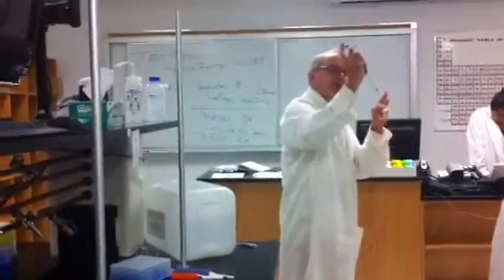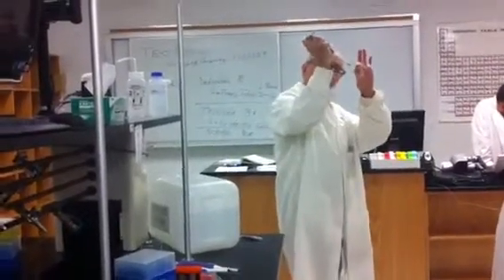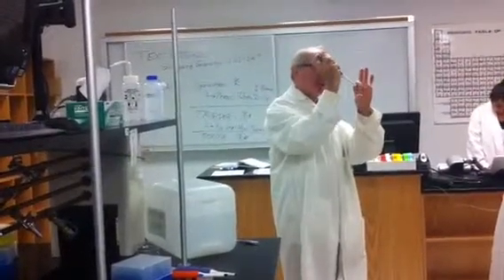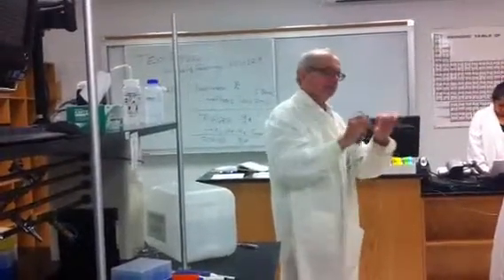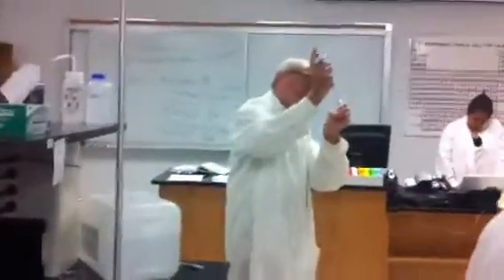I go back and forth on this thing a few times here, like that. It's not a one-time shot. Why? Because mixing is crucial in this thing. So I go like that, and then you see what I mean. In other words, it's open. I have the enzyme here. The tip goes below the nose.